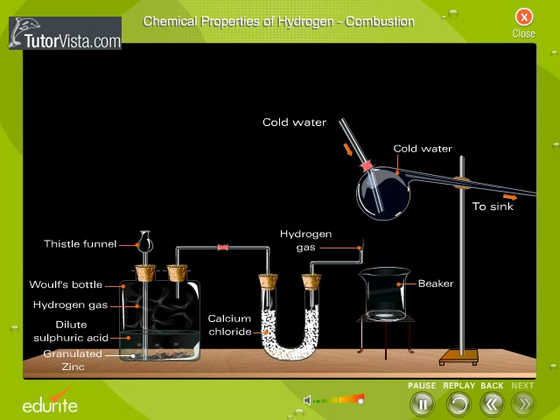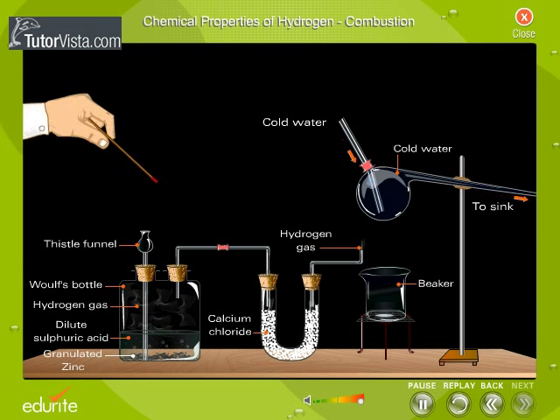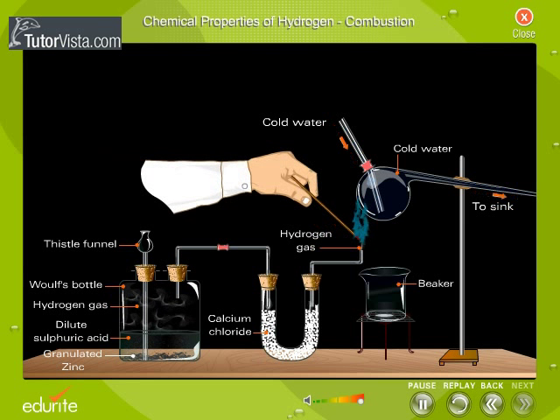Arrange a setup for circulating cold water. Bring this flame near the flask in which cold water is constantly circulated.